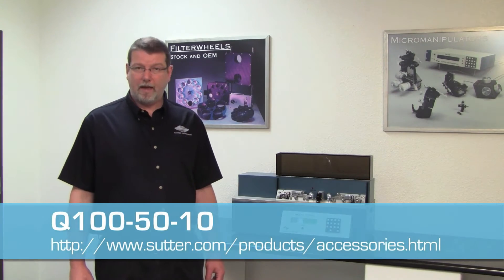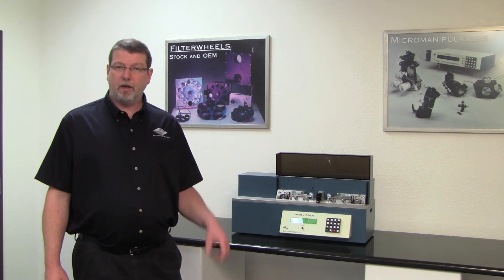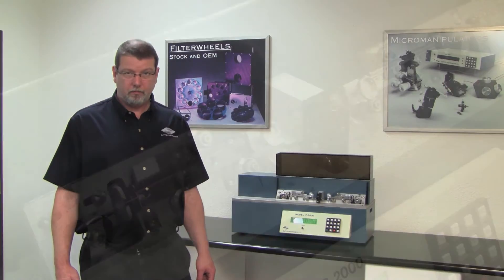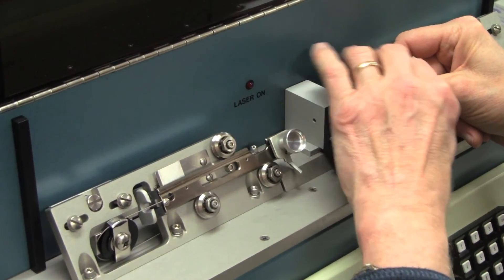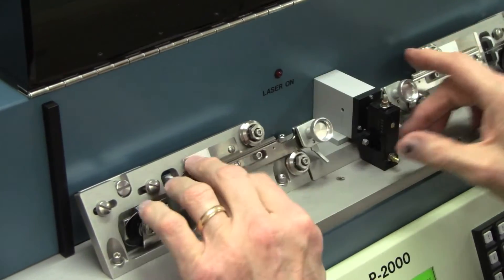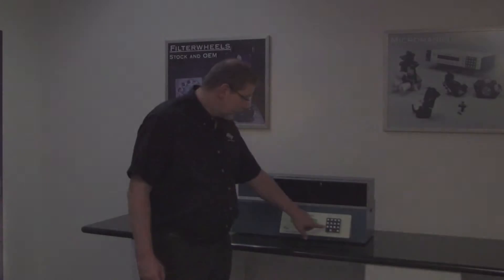In our first set of video clips, we used 1mm thick wall quartz glass, item number Q100-50-10. Sample program number 1 pulls a patch pipette with a short 4mm taper and a pipette opening of about 1 micrometer in diameter. Reloading the quartz glass capillary into the puller bar on one side, bring the two puller bars together and clamp the other side. The lid must be closed, program 1 is selected, and action!